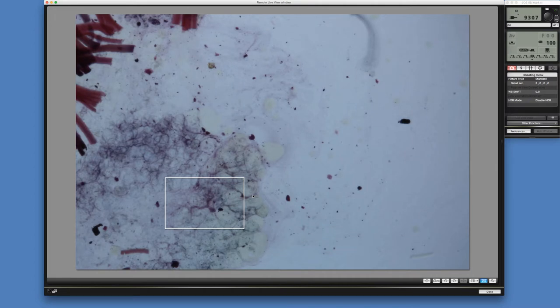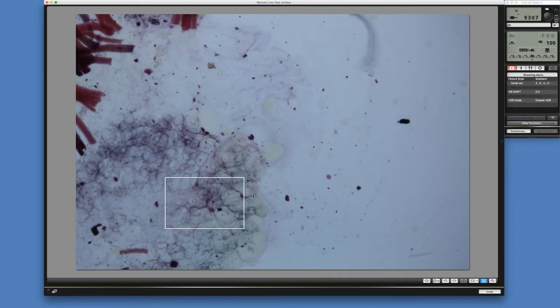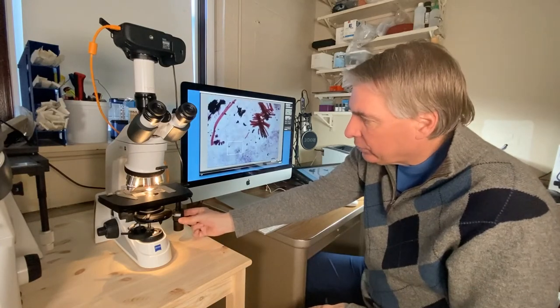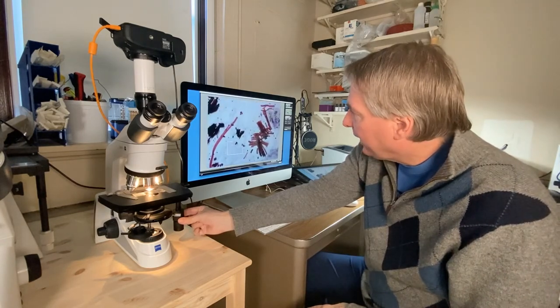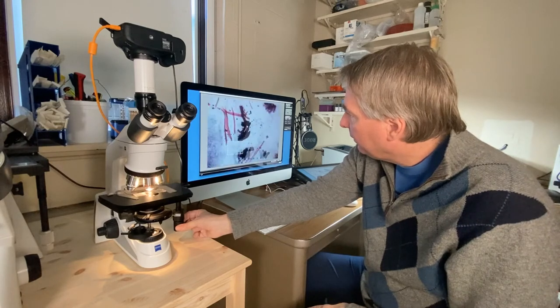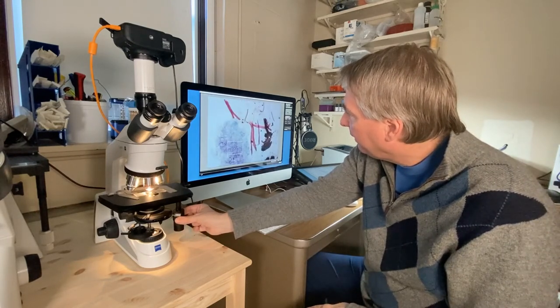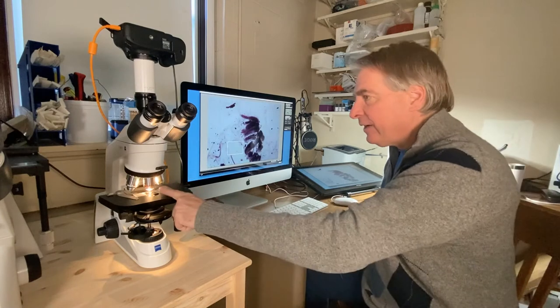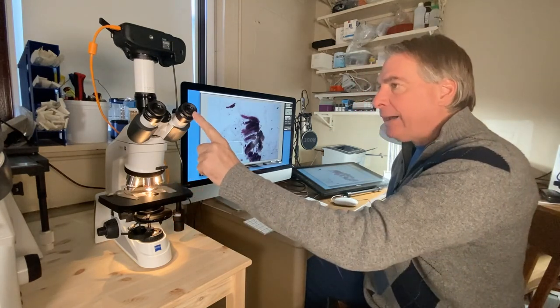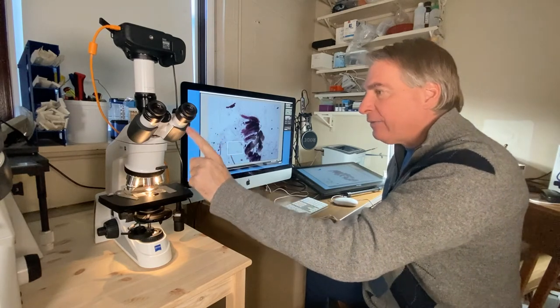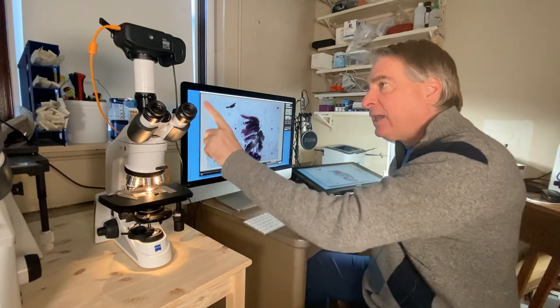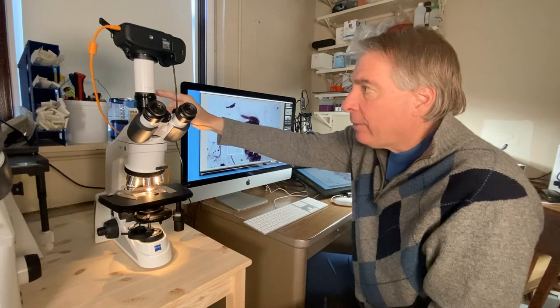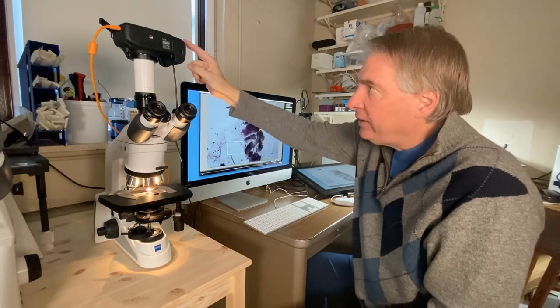Now if I want to move the sample I can move the slide left and right with this knob and towards me or away from me with this knob, and we can zero in on our sample. We're only at 5x in this case — the 5x objective — and if we look through the eyepiece, these are 10x eyepieces, so the total magnification would be 50x. The camera itself also has optical elements in this barrel that are about 10x, so it's 50x going to the camera as well.